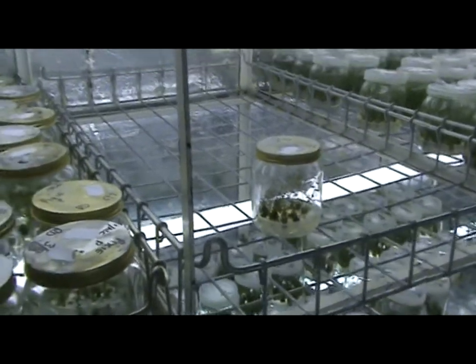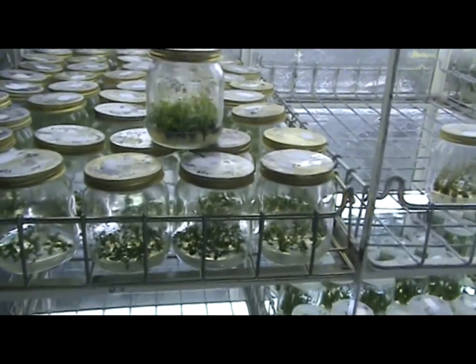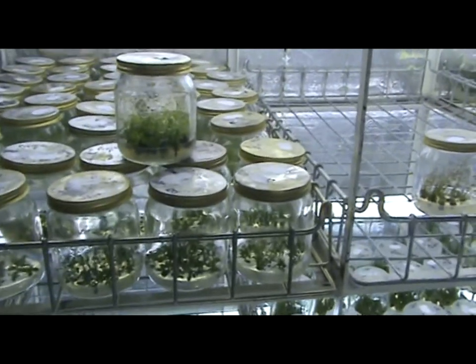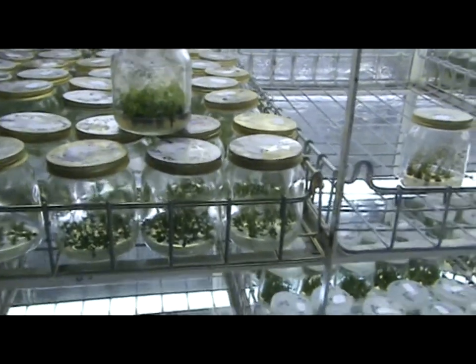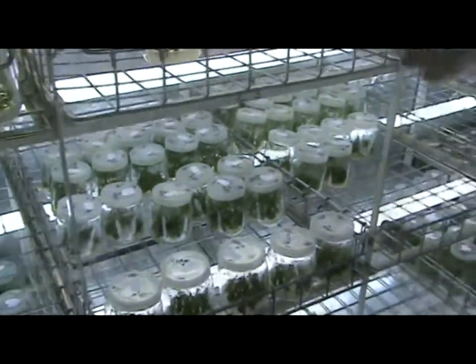The culture medium also contains various other things which enhance the growth of the plant, make it branch or root, and those growth regulators, as we call them, are quite critical to the production of the plants.